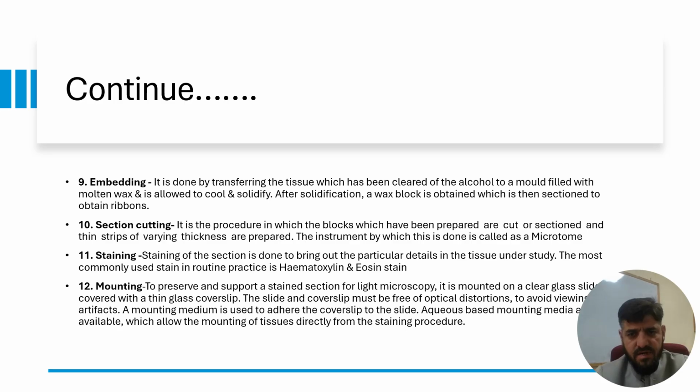Then there is another terminology that is known as mounting, and it is to preserve and support a stained section for light microscopy. It is mounted on a clear glass slide covered with a thin cover slip. There are different types of media which are used for mounting, and those chemicals are known as mounting media. So this is the basic roadmap, and in future lectures we will discuss these topics one by one in proper detail.